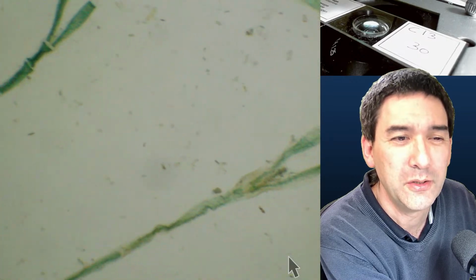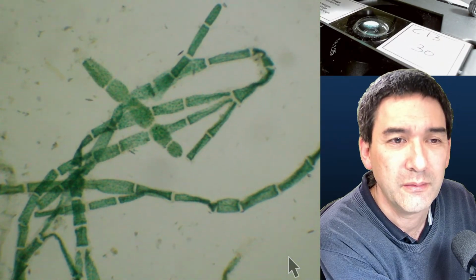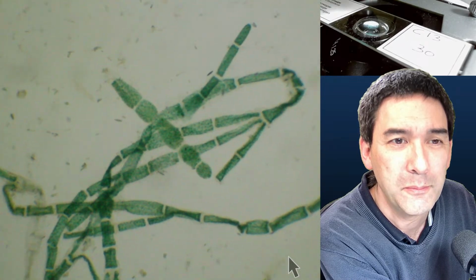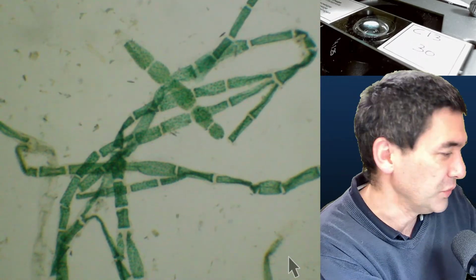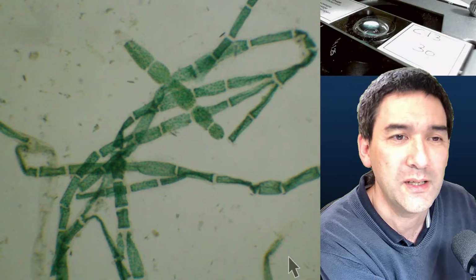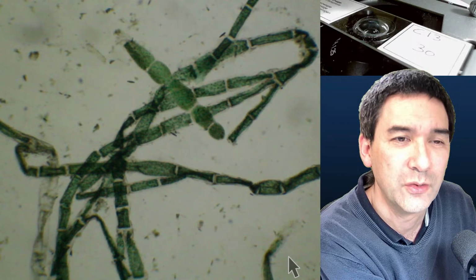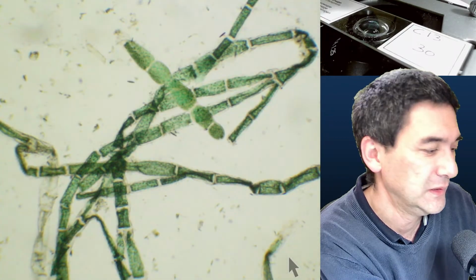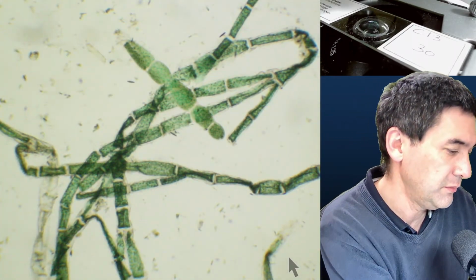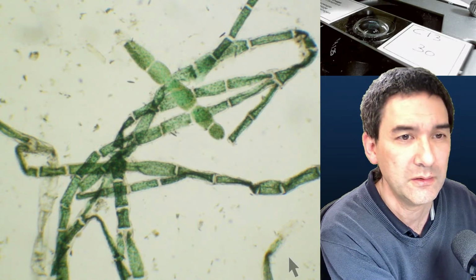Probably a fresh specimen would be better. I'm kind of surprised, those slides here are quite old, several decades old. I'm still surprised that it was able to keep the green color of the chlorophyll. So now, being a water sample, let's use blue yellow again.